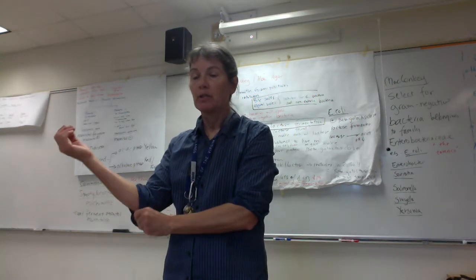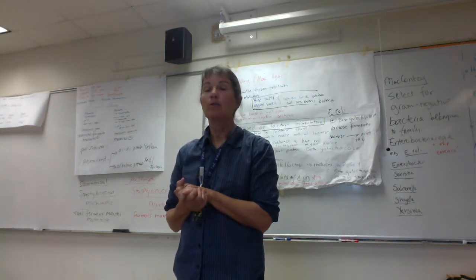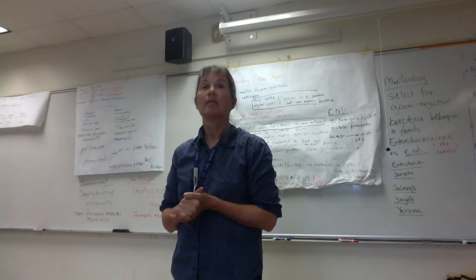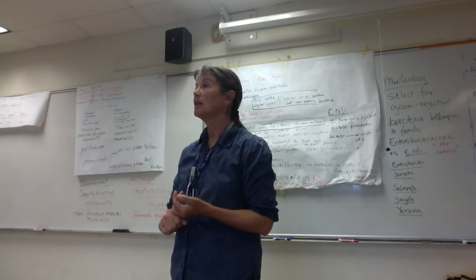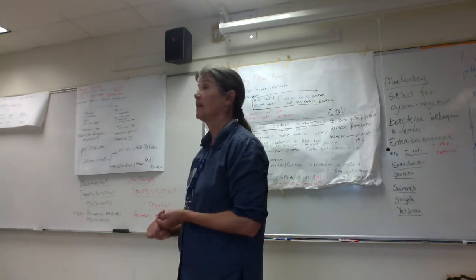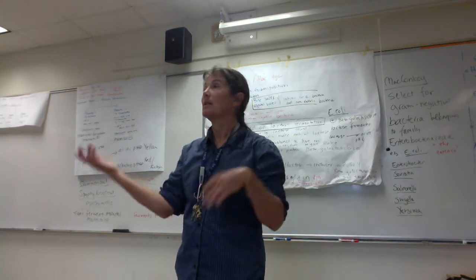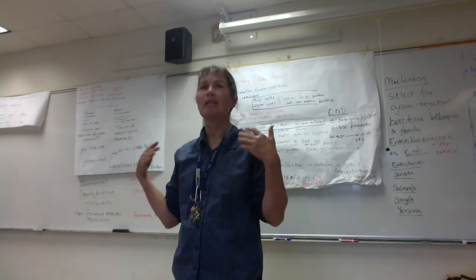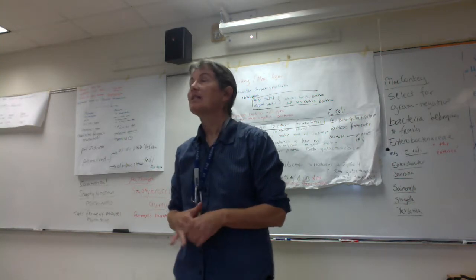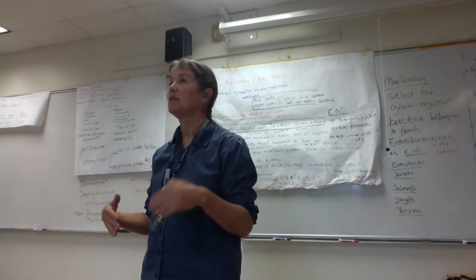Now, folks, we're going to pretend we're public health microbiologists. We've been asked into a community because there's an outbreak of diarrheal disease, and there's suspicion that either drinking water or food has been contaminated with feces, right? So we're trying to find out, is it some well water contaminated? Is it some food contaminated? We're going to be screening lots and lots of water samples and food samples. Now, let's think about what kind of pathogens could be in feces. Why do we worry about fecal contamination?